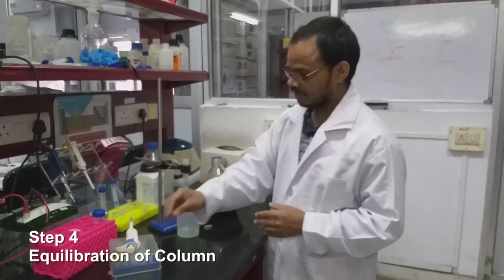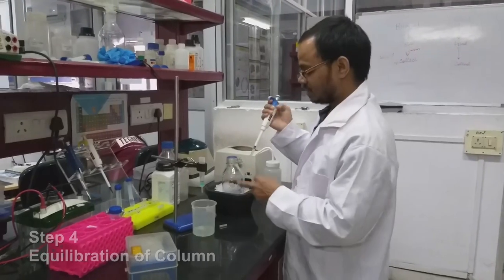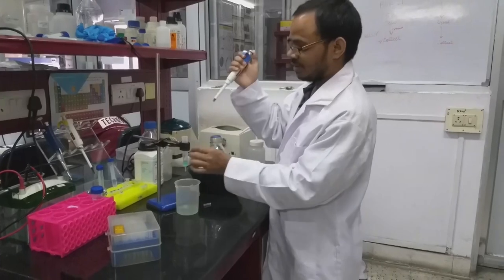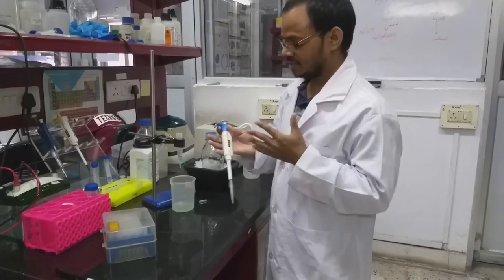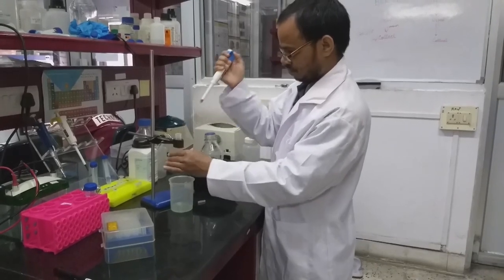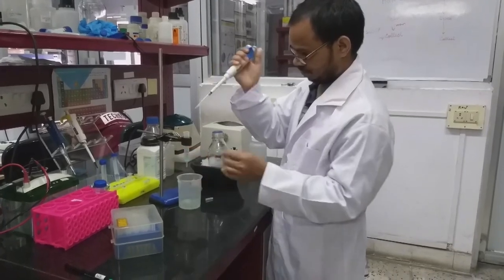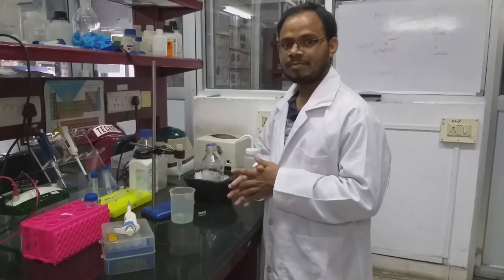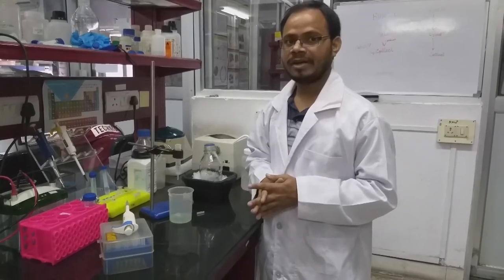So after 20 minutes we eluted the nickel solution. Next we will equilibrate with the lysis buffer. We have to wash at least 2 column volumes to remove any free nickel which exists in the beads. So after equilibration, the next step is we will load the lysate and then incubate for binding.